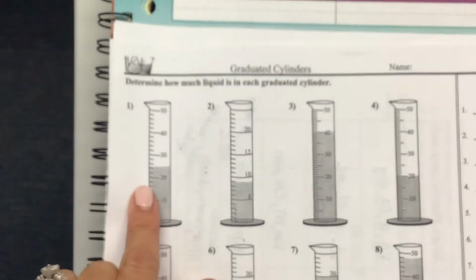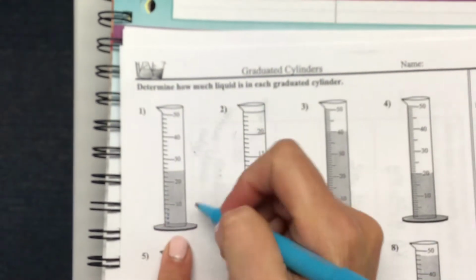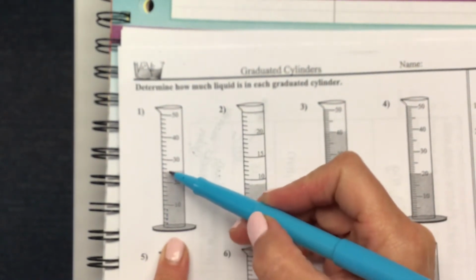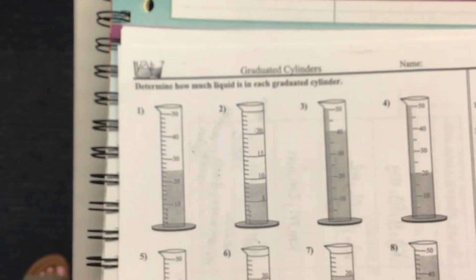Okay, so the first one, who can tell me how much liquid is in number 1? Every hand should be up. Some of you aren't even looking at the right page. How much liquid, Carter? 24 what? Okay, you're pretty close. 24 milliliters.